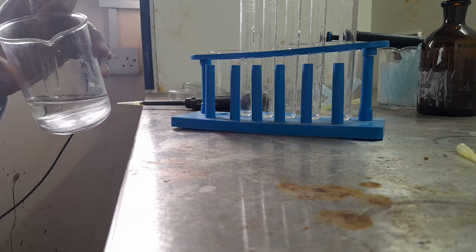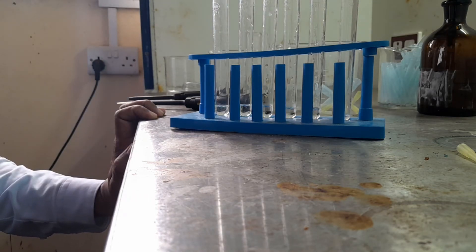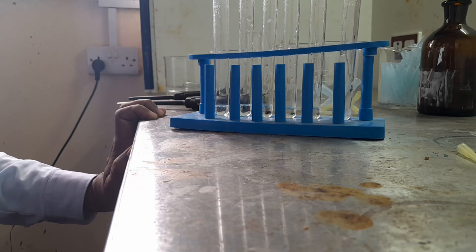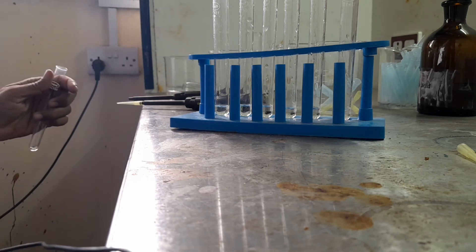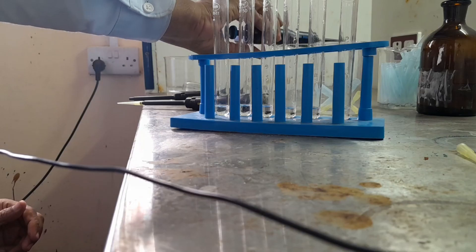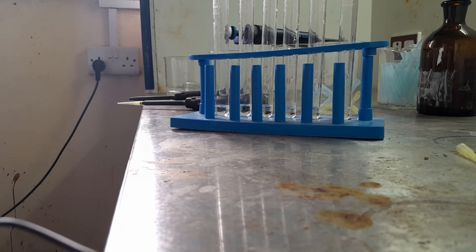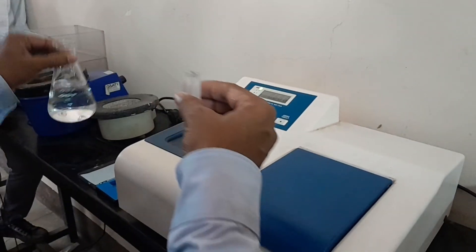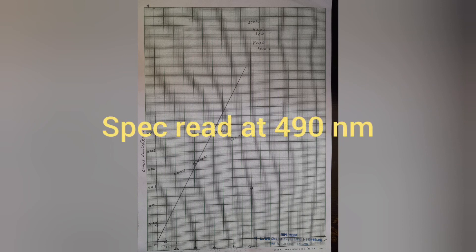This is the blank. Then we need to add 1 ml of sulphuric acid to all the tubes. All the steps have been covered. Keep the tubes for incubation at 37 degrees Celsius for 10 minutes. With distilled water, set the blank to zero.